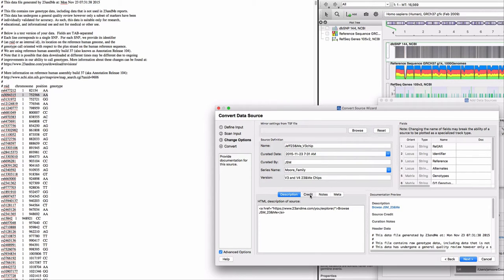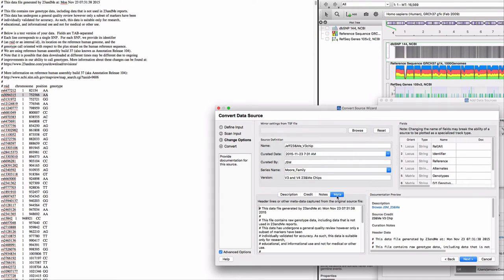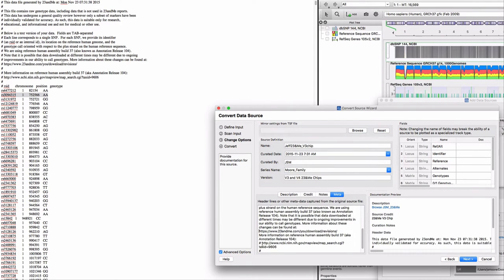Go ahead and complete the other items. For the notes I'll just clean up the header information that came with the raw data file. While you're working on this, let me show you how the link will appear in Genome Browse.